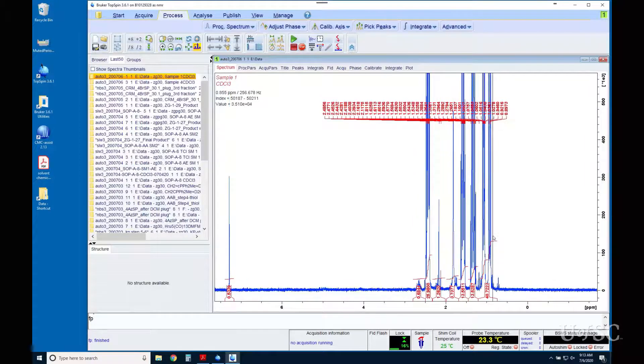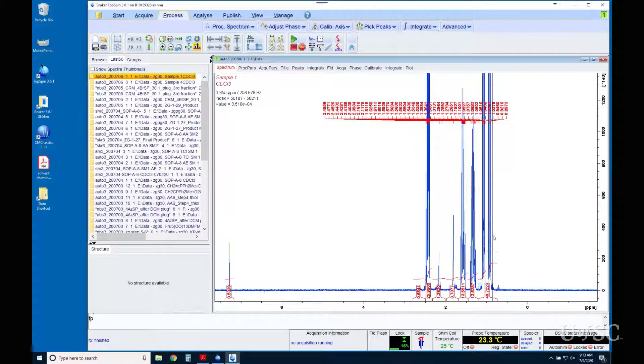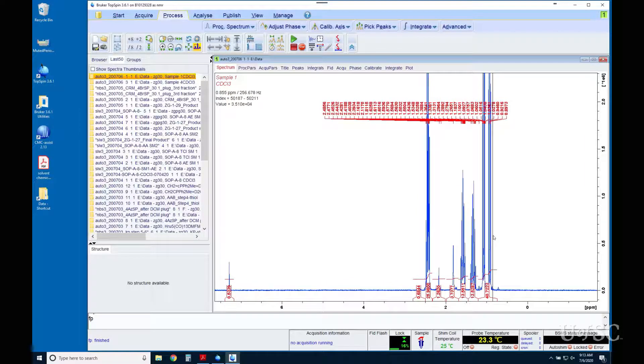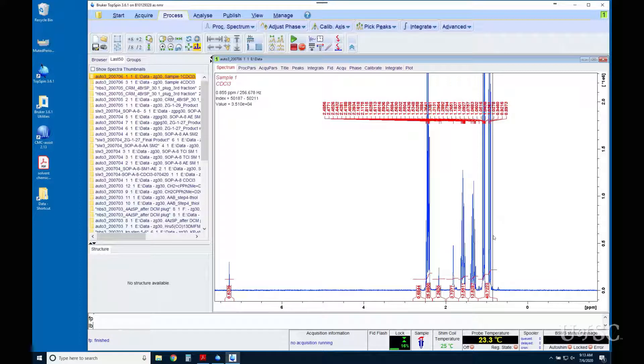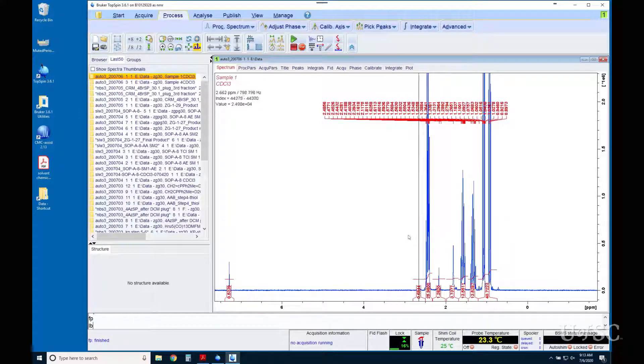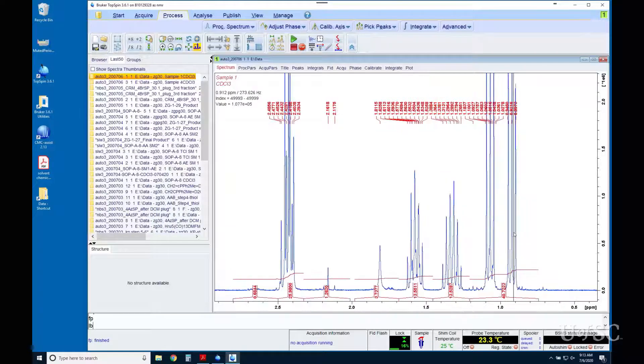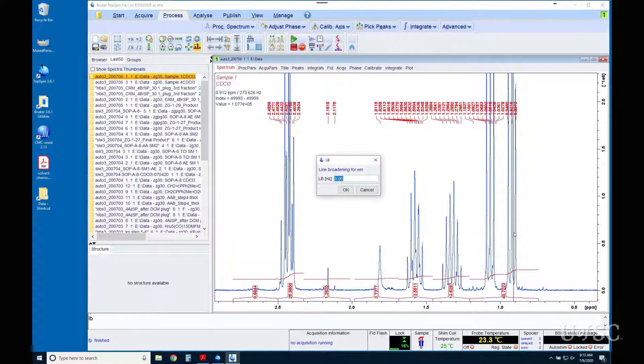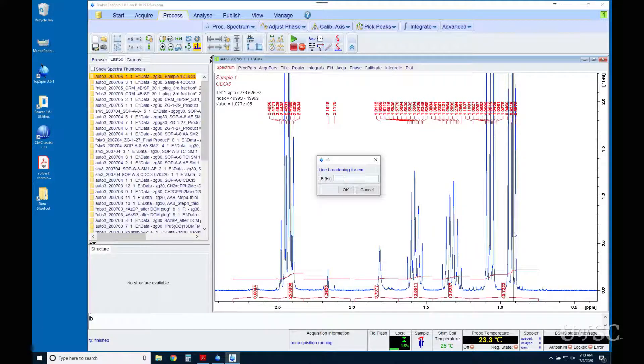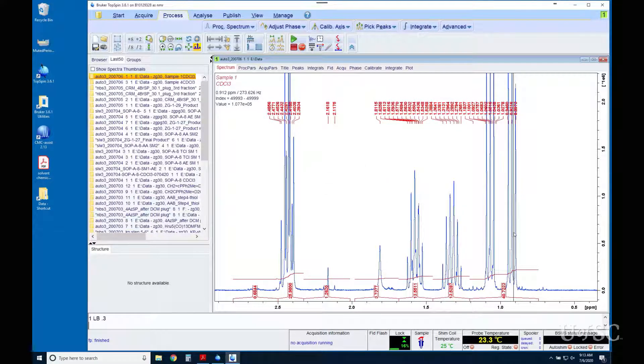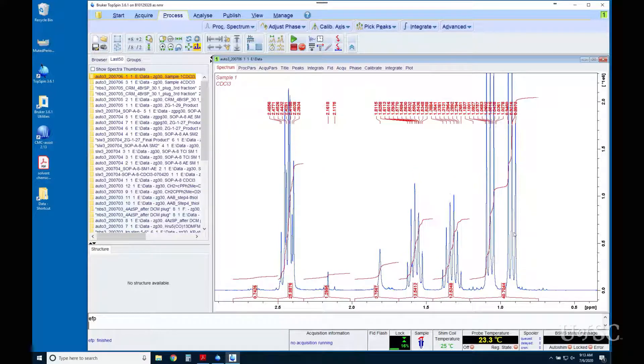A good starting value for LB is the reciprocal of the acquisition time, which for proton is about 3 to 4 seconds and for carbon is about 1 second. So, if I set LB to 0.3 and reprocess with EFP, I usually get decent line widths and manageable noise with samples that are not too dilute.